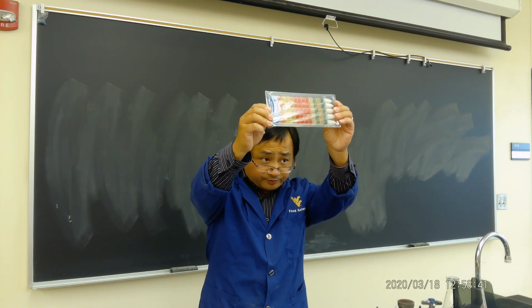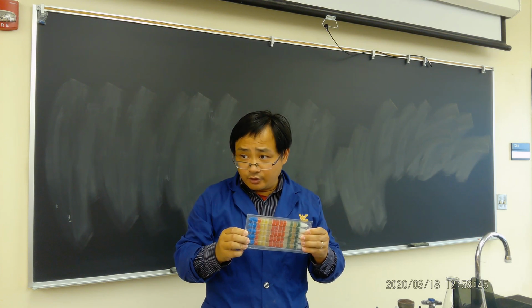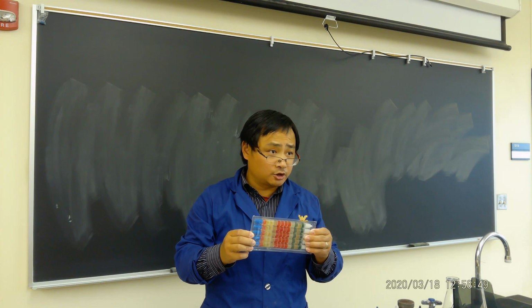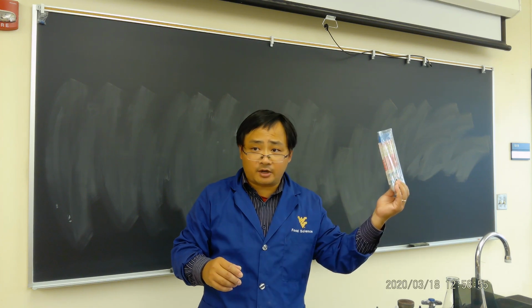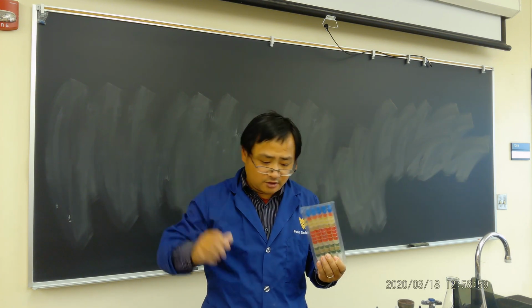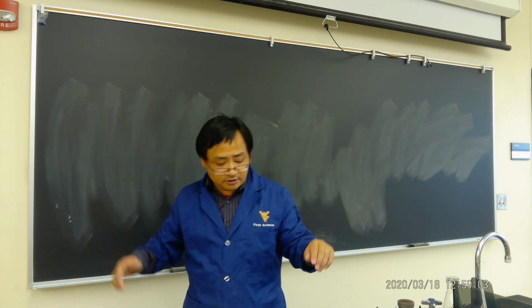It's like a pencil. So we will do it. Looks like we're going to do a pair, which means 2 of you do 1, because this one box is about $300. One channel might be like 20 bucks or something. So I just want to save a little bit.